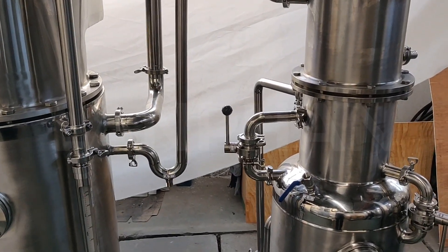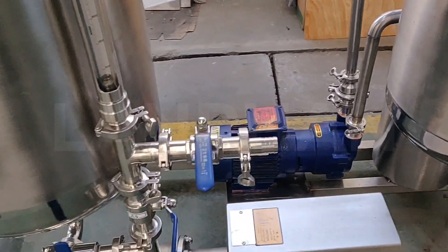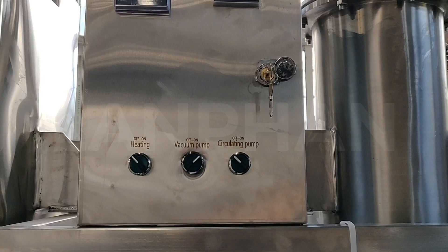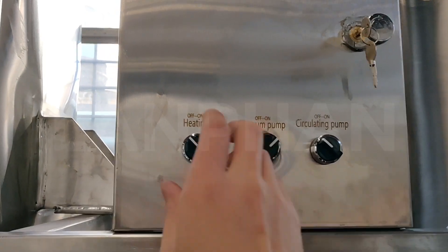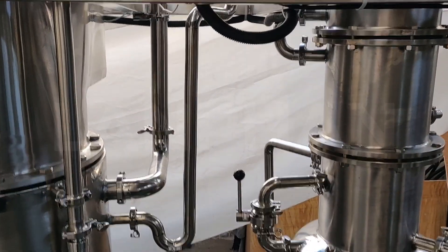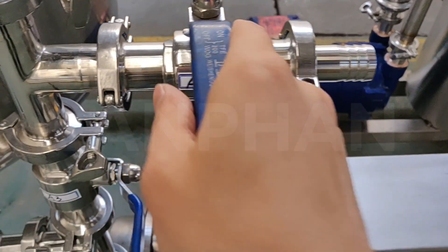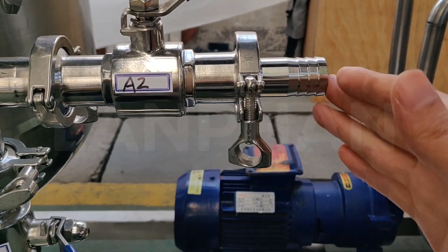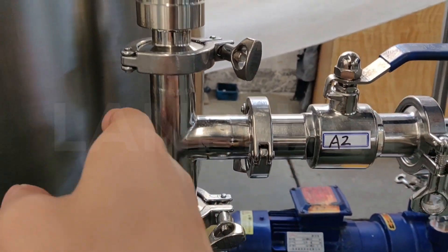After a period of cooling time, we can start to fill in the raw materials. We also need to open the heating button, and then we can start to fill in the raw materials. Here is the filling port.